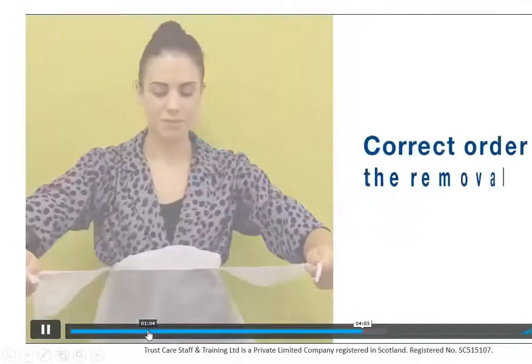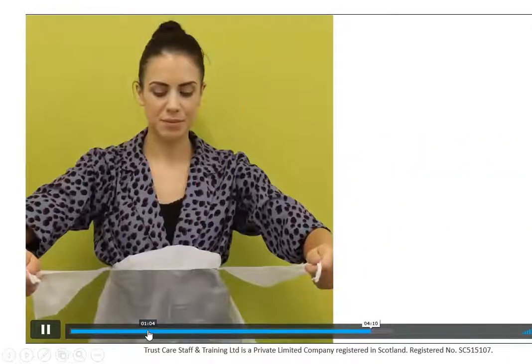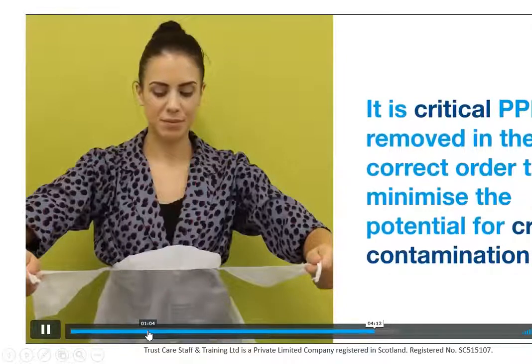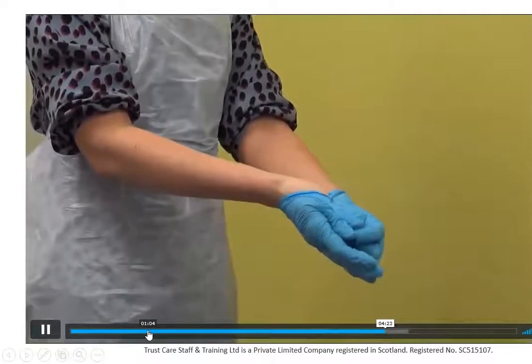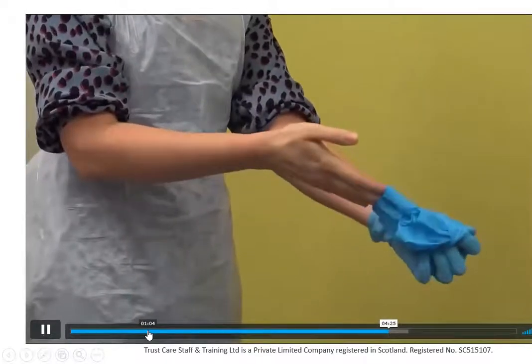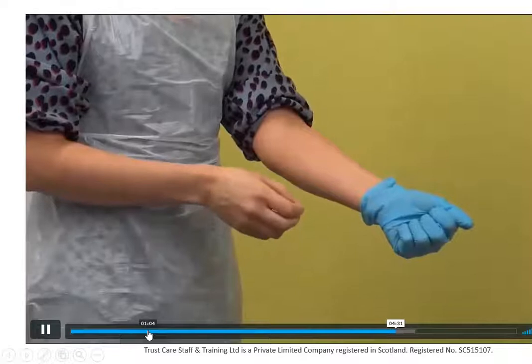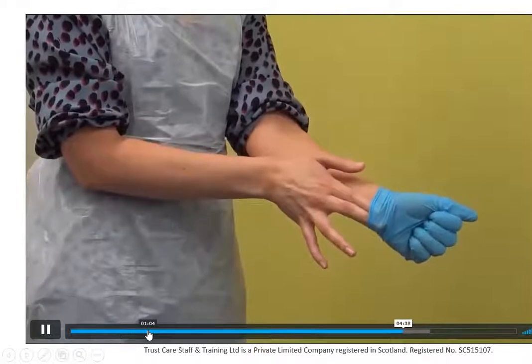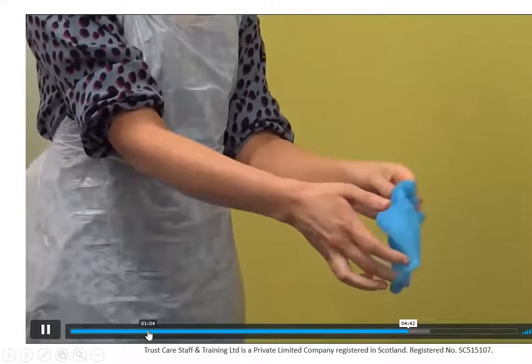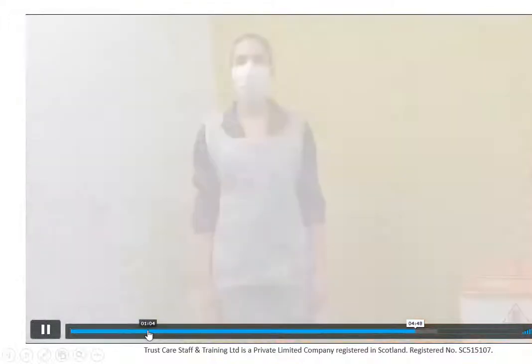This part — taking off PPE properly — is really, really important, as it stops the potential for cross-contamination. Don't touch the outside of the glove with your bare hand. Use your gloved hand to peel the glove back over itself. Put your fingers in onto the other glove and roll it down, so you'll have a package of two gloves and you haven't touched the outside. Discard it straight away.